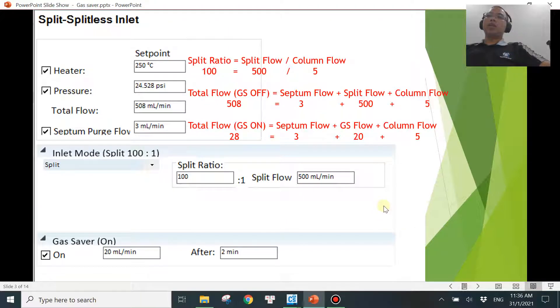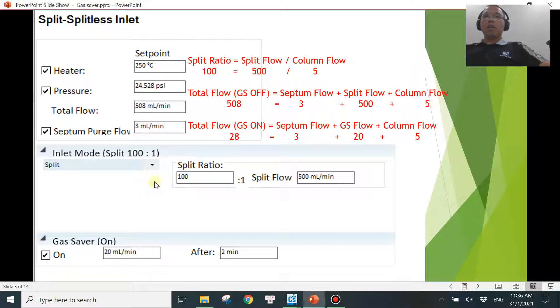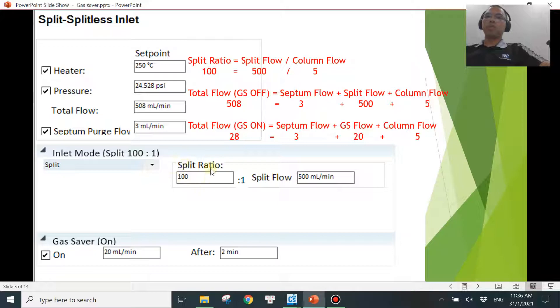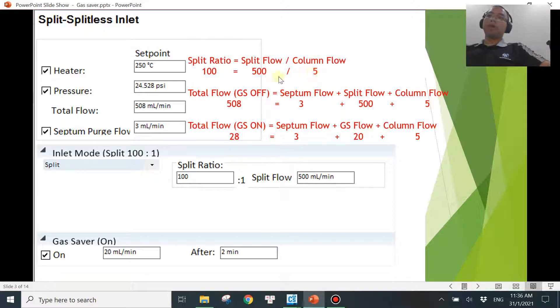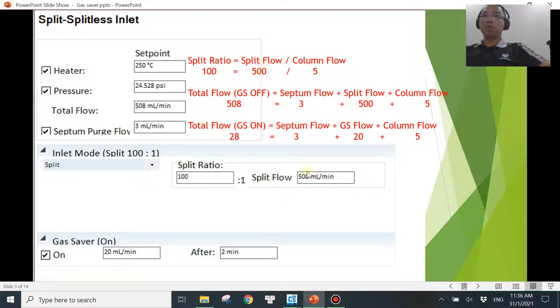This is a typical screen when you come to set up your inlet parameters. The split ratio is defined as the split flow divided by the column flow. In this case, the split ratio is at 100, which means the split flow is 500 mL/min, and the column flow is set at 5 mL/min — so 500 divided by 5 gives a split ratio of 100. Because these values are dependent on each other, if you change the split ratio, the split flow will follow accordingly, and vice versa.